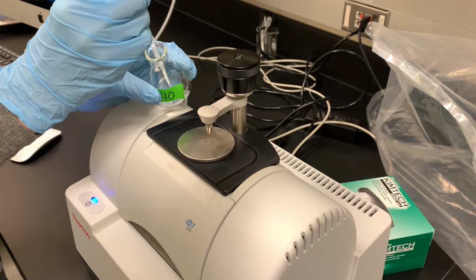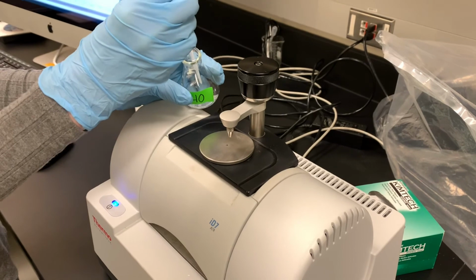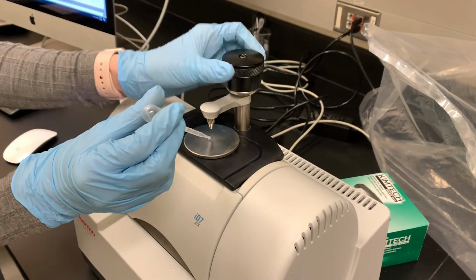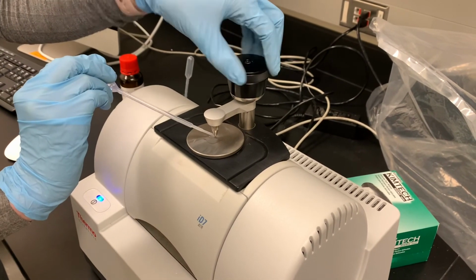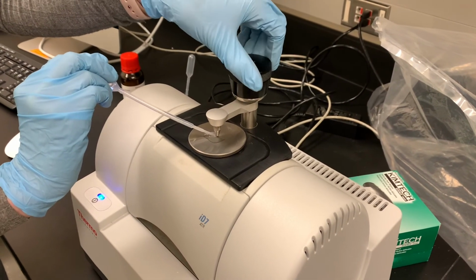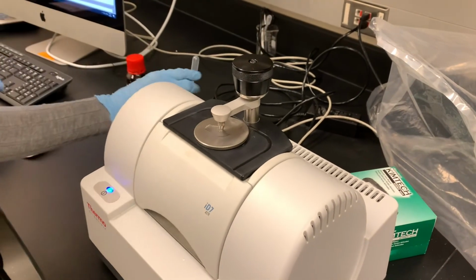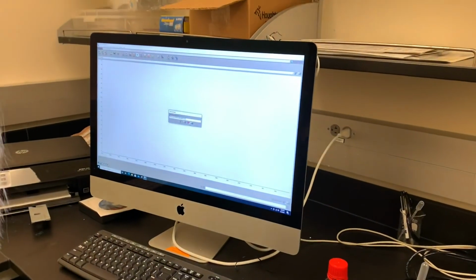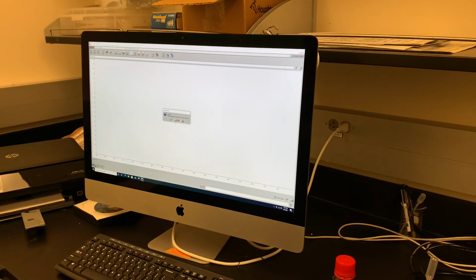This smells really strong. It smells pretty strong. So because it smells so strong, that means that it is really volatile. It evaporates really easy, and that's going to make it really hard to capture an IR. So what I'm trying to do is trap it underneath this tip, and then I want to get my spectrum as quick as possible. Ooh, it is a strong smell.